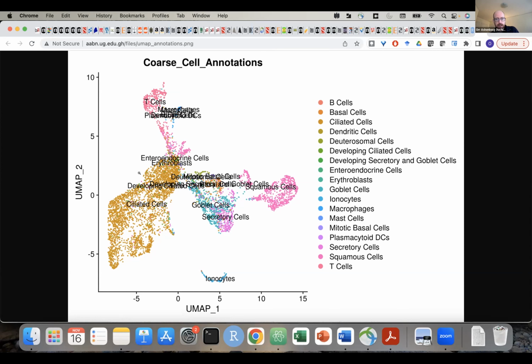And how these cell types were identified is using methods that Sergio had discussed with you in the last hour. Yeah, so this is great. We're seeing all the cell types that you were supposed to see when looking at this tissue type. And then we can also do some other things, like we can label the plot by any metadata we want. You can look at all the things that are measured in the metadata. These are all the different things that are stored in the metadata, and we can color the plot by whatever. Like here, we're going to group it by COVID-19 status.